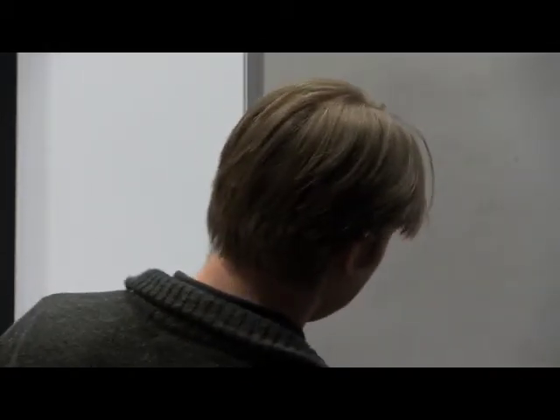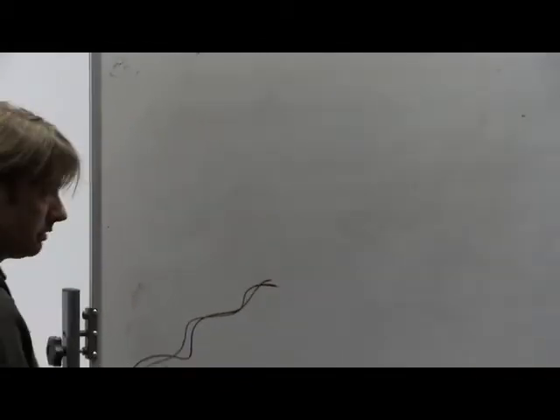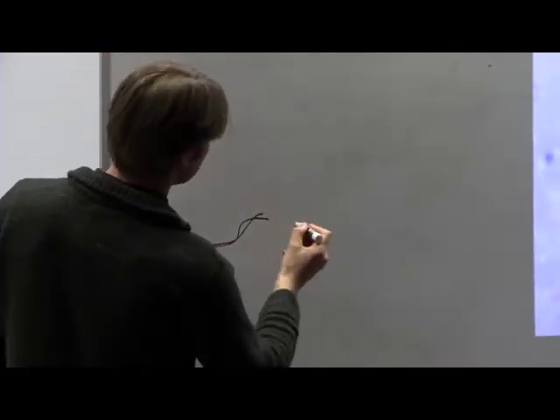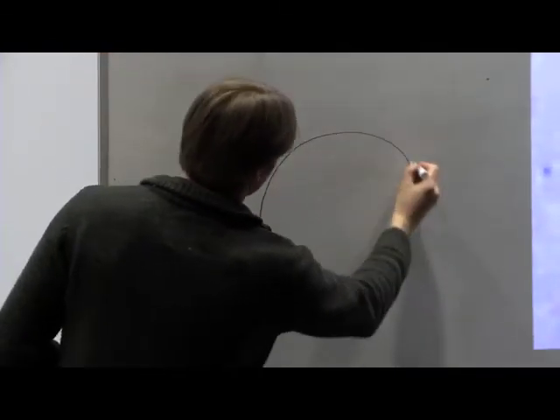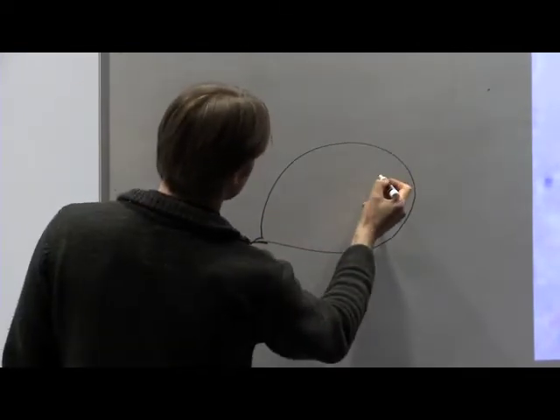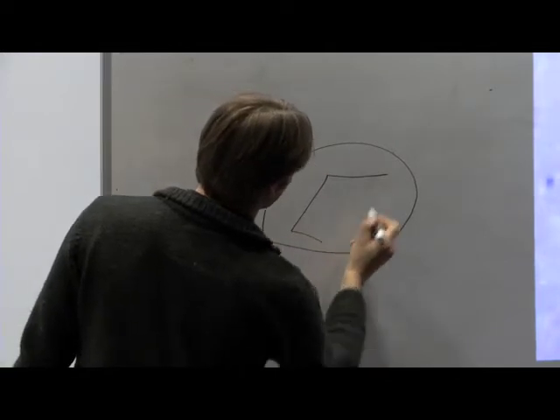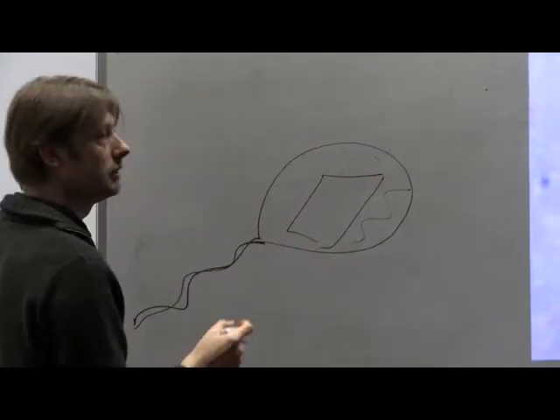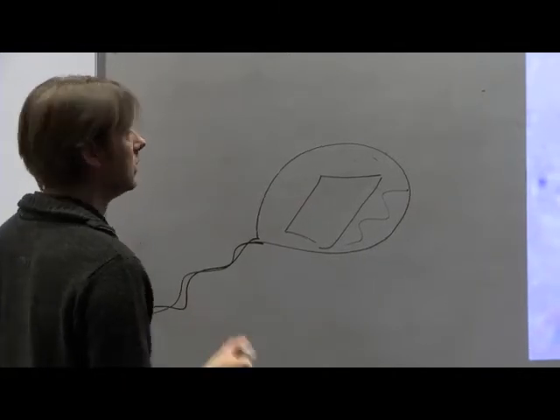So if you zoom into a loop, it's tiny, you can hardly see it by eye. There's a nylon loop that diffracts very poorly. And the loop can be of different sizes, and so you catch your crystal in there. And then around it is the liquid that your crystal is in as you pull it out. And that's the problem.